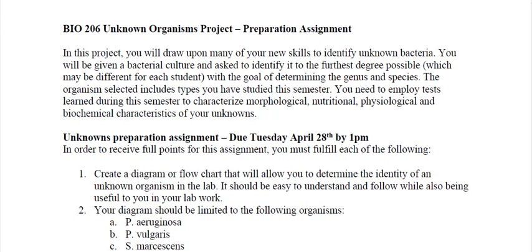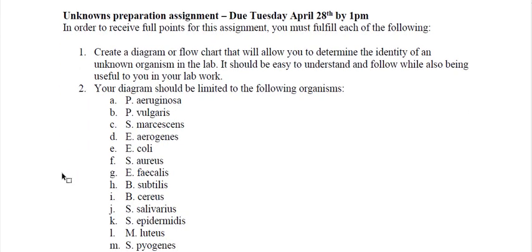So basically you would be handed an unknown, and then throughout the course of several weeks you would have every single type of media and supply, including incubators and things like that, slides and microscopes available to you to identify this unknown. This preparation assignment is to prepare you to be able to identify the unknown so that when you walk into the classroom, you know exactly where you're going to start and where you're going to go. So this project, and of course we're not going to be in the classroom, just remember we're approaching this from if we were, so it makes a little bit more sense.